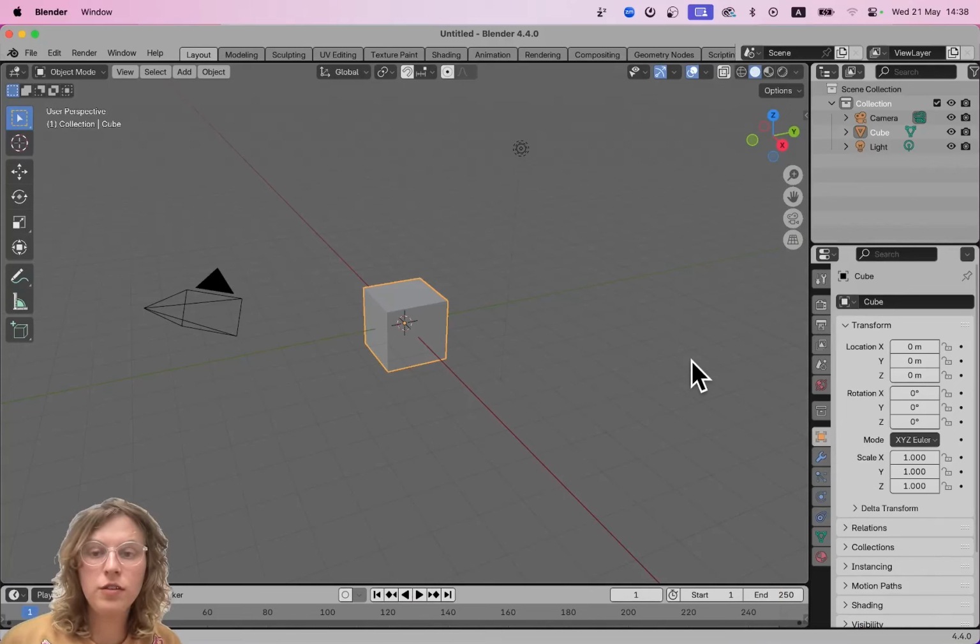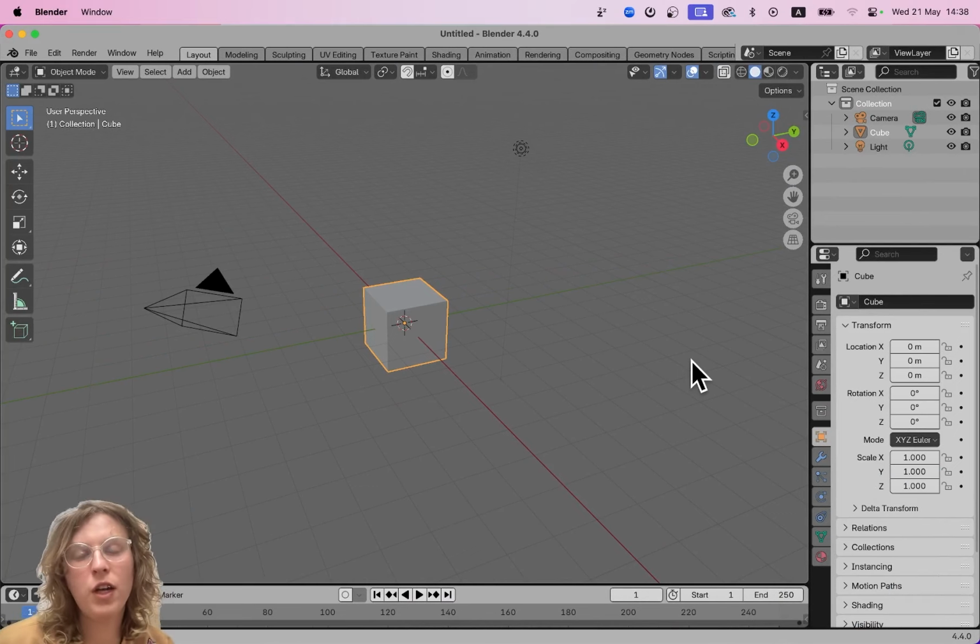Welcome to the tutorial for loading masks and surfaces in Blender with Microscopy Nodes. Here I assume you've already seen a video where we load our data as volumetric data, and now we're going to go over how to load them as surfaces, but also how to load binary masks and label masks.